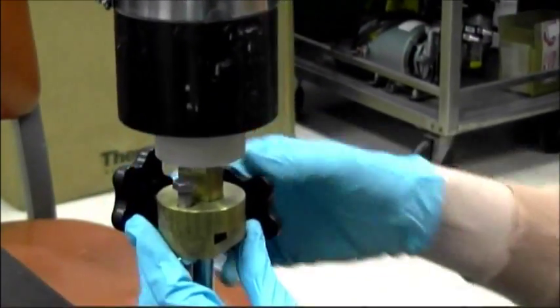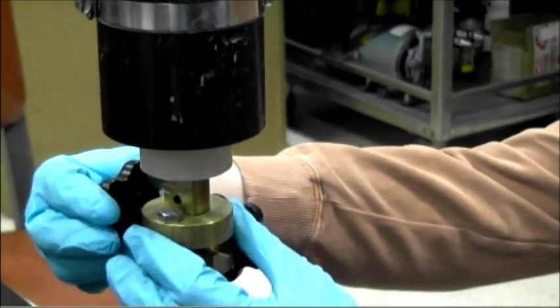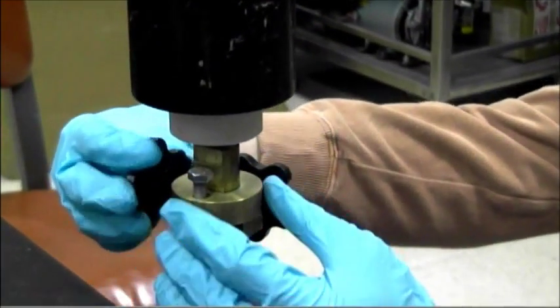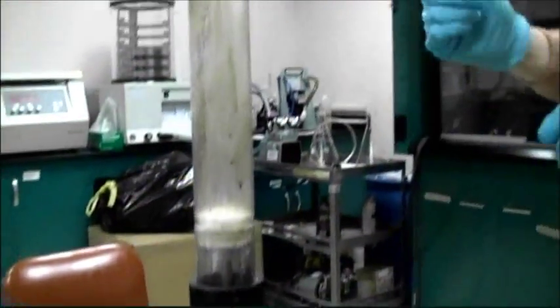So you notice if I lower this bottom one down, I loosen it, it drops down one centimeter, tighten it, loosen the upper one, it drops down one centimeter, and then that will push the sediments up. But it's not going to push right now because it's capped on top.